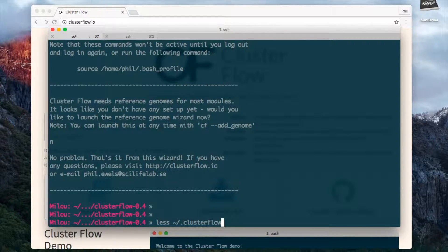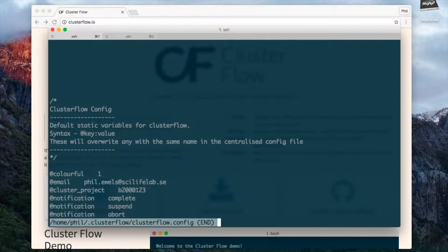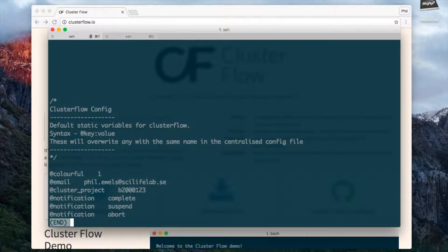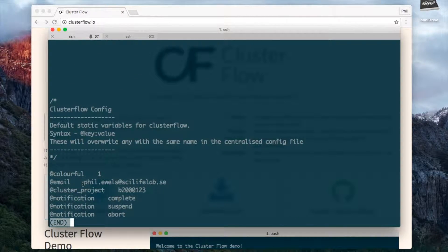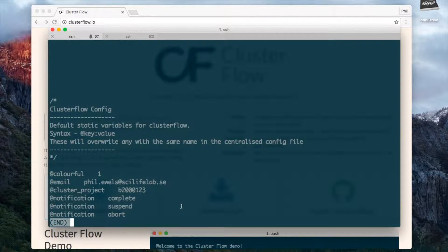Okay, so that's finished and I now have a config file which I can see in my home directory in a hidden directory called clusterflow and there's a file called clusterflow.config and you can see those settings I put in here. I can see my email address, my project and some of the notification settings.